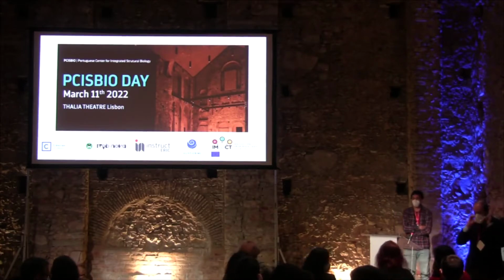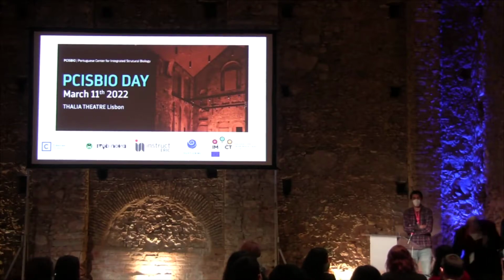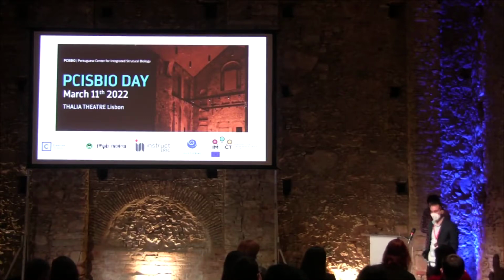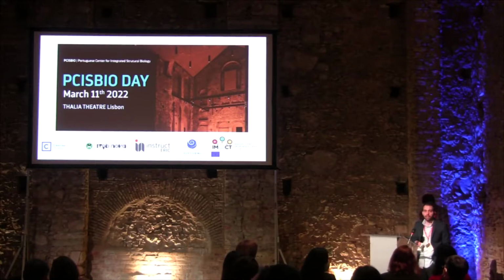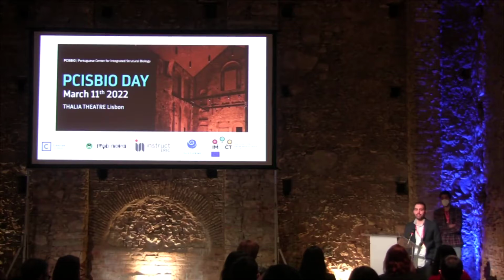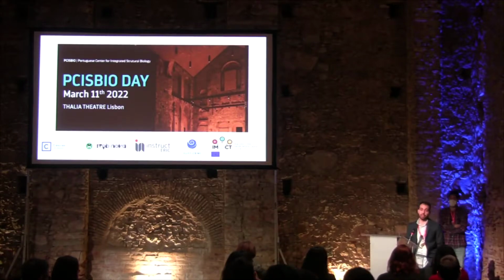So thank you for the nice talks that you presented. So I have the first question for Tiago. So you are the first selected. So I'm curious to know, well, if you know, what is the yield that you get on the cell-free system? So like the amount of protein? Yes, we know. It's about 2 milligrams of protein per 9 milliliters of medium.